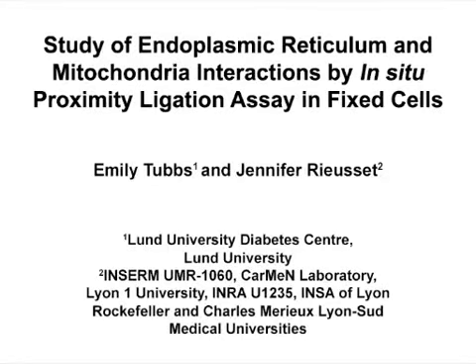The overall goal of this experiment is to visualize and quantify endoplasmic reticulum mitochondria interactions using an in situ proximity ligation assay in fixed cells. This method can help to answer key questions in the biomedical field to better analyze ER mitochondria interactions in fixed cells using a simple immunofluorescence technique, hopefully suggesting new treatment strategies.